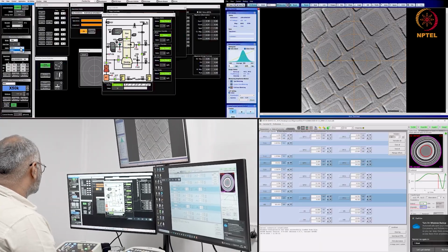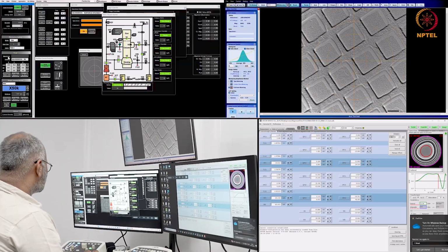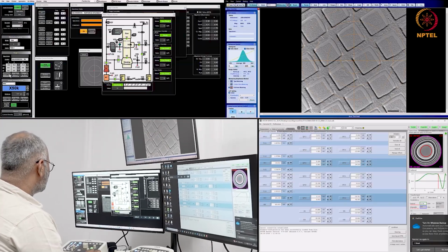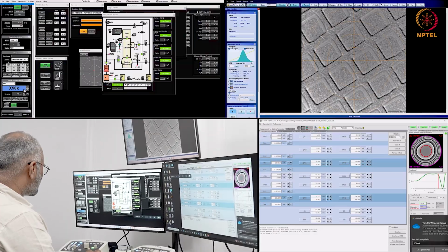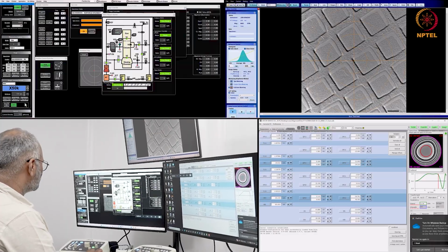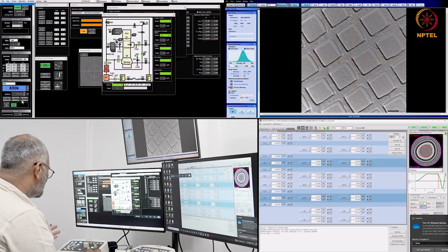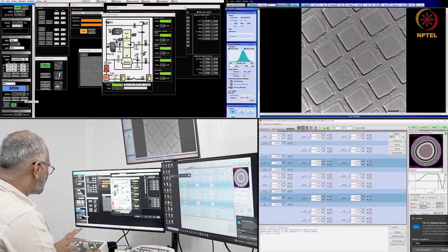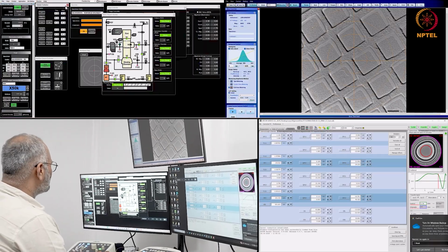The alpha value is TEM-S now. Spot size is 1. The specimen information is here, and the image forming system information is here. All your magnification values, the defocus, and whether you're using superfine, neutral, or standard focus, which is connected to the focusing, is all given here. The wobbler controller is here.